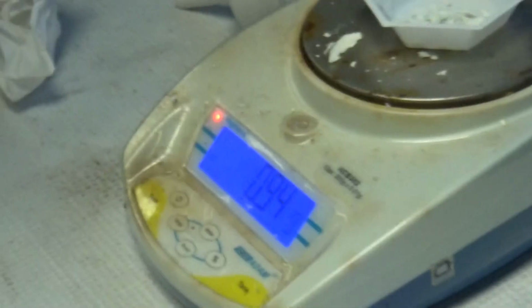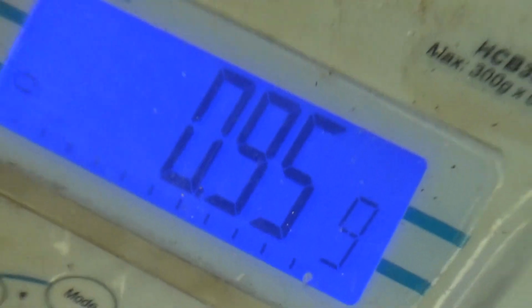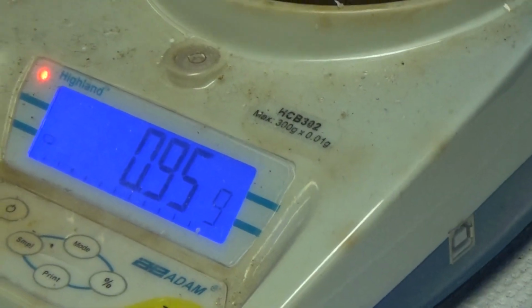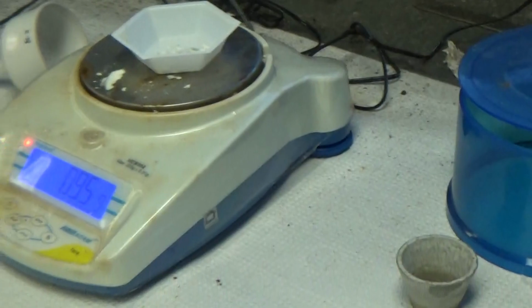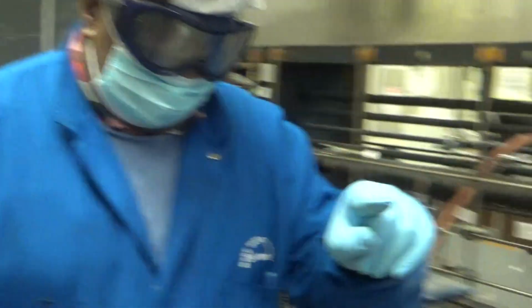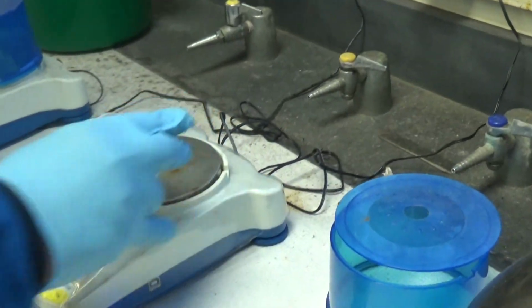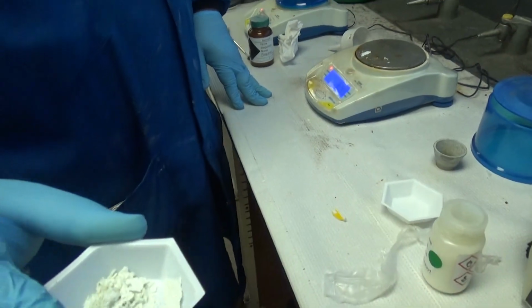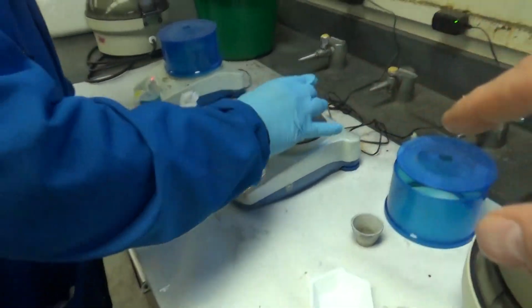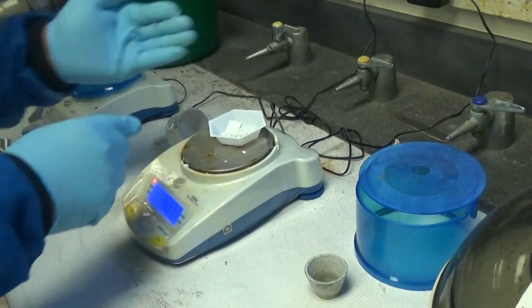Okay, that's 0.94. 0.94 gram of crude product. Roughly 0.9495 grams of crude product. Here is a crude product. And a little bit today on the balance. Do you want to get that out? Okay, good. Get your yield up. There you go.